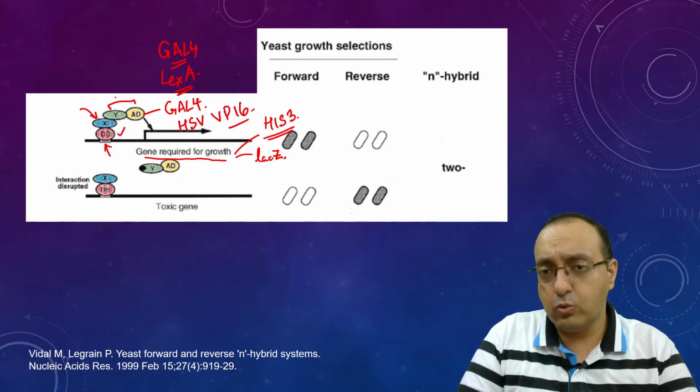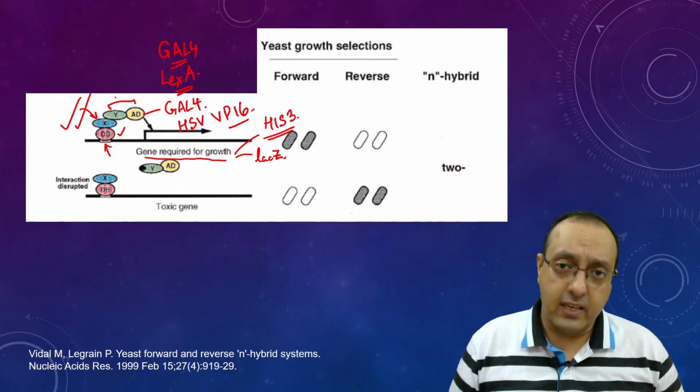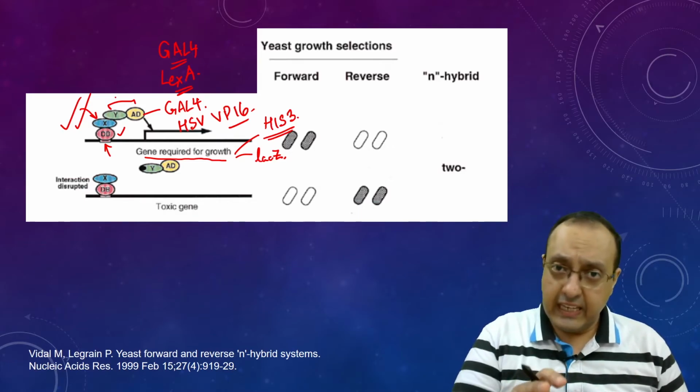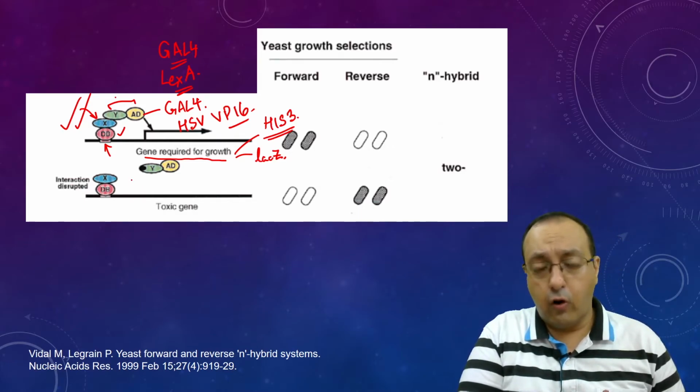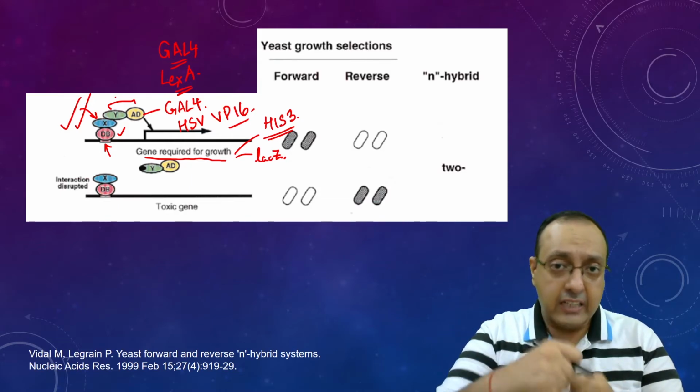So that is the Yeast Two-Hybrid assay. We can also develop a reverse two-hybrid assay if we want to screen for interaction deficient alleles. In this case, we want to look for mutant versions of the X or Y proteins which can't interact.